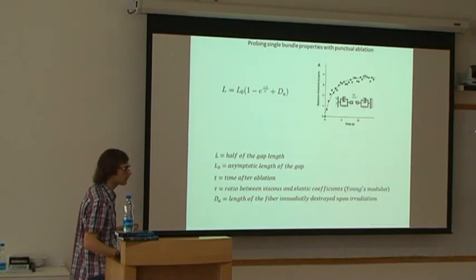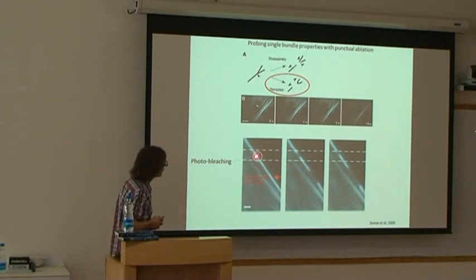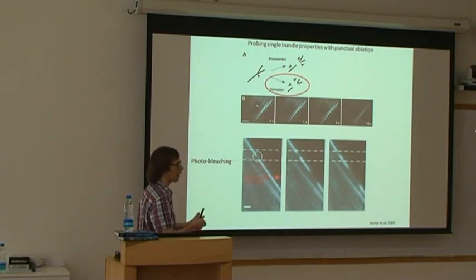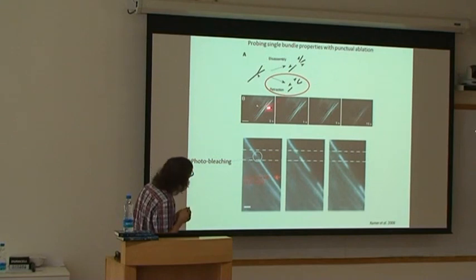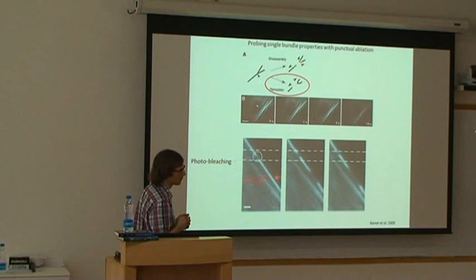It doesn't move without the cutting. What he shows here is that the cutting certainly produces fiber relaxation, for sure. And with this one, he also shows that there is no disassembly. Right? So with this, he shows that the depolymerization hypothesis is wrong, and with this, he shows that retraction is correct. The time scale, okay, it's not written here, but I would say it's around half a minute or even less.